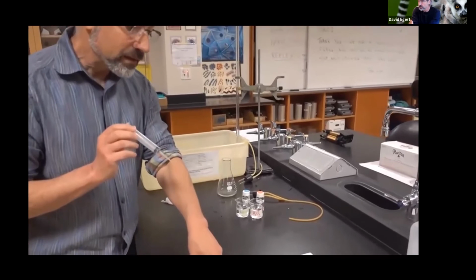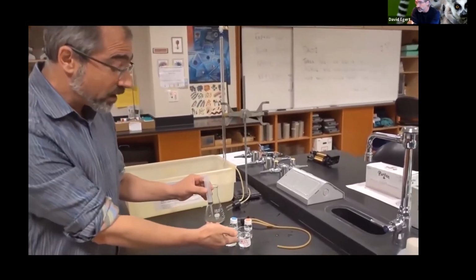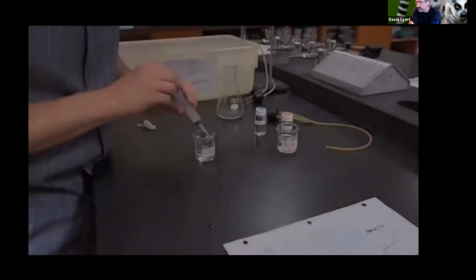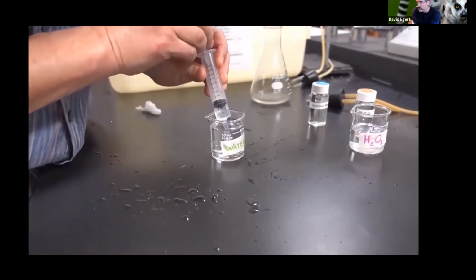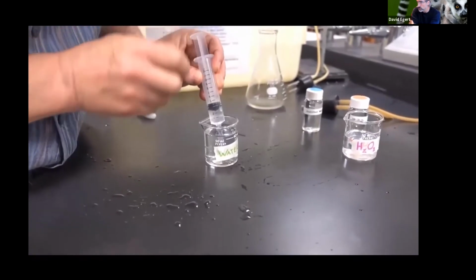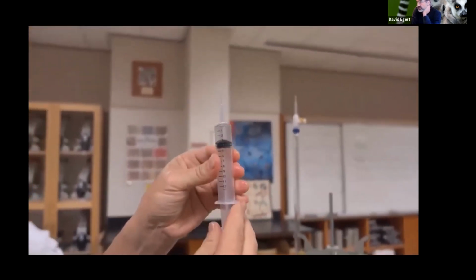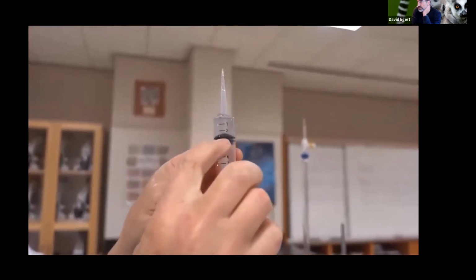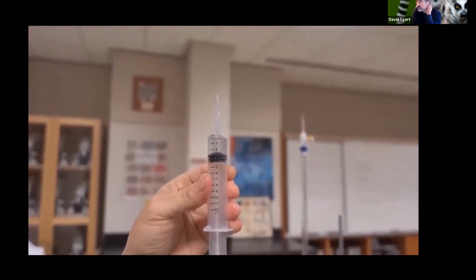So as you heard, we want to make sure we start by bringing up our water. I need 3 mils of water. All right, so I am going to suck up my water here. Again, I need 3 mils, so I suck in a little more than 3 mils. And then you can knock out all the air bubbles, and you bring the plunger up until the black of the plunger is exactly on the 3 marking. That means there's 3 mils of water that are going to get squirted out.